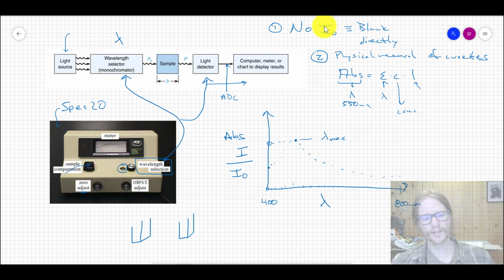What that does is it presents an opportunity for introducing error to the system, because if you rotate this thing 90 degrees, you don't remember, there may be microscopically different thicknesses of glass, and if you're normalizing to that, that's a pretty big effect. You could put a fingerprint on this. You could accidentally dilute your sample or your blank because you had a couple residue drops after you rinsed out your blank, then you put your sample in. This is only 3 mL, so even a few drops is going to change that significantly. There's lots of issues, right?